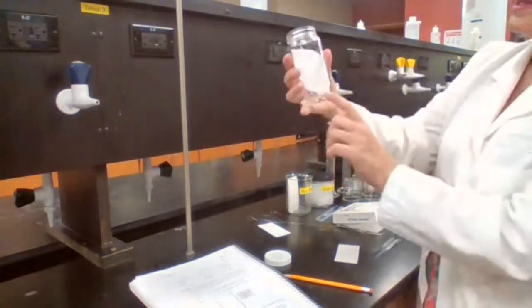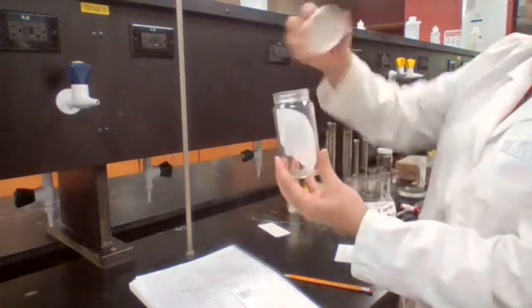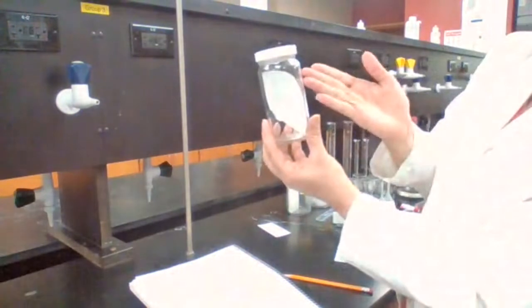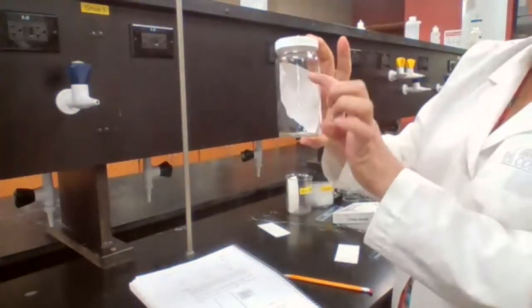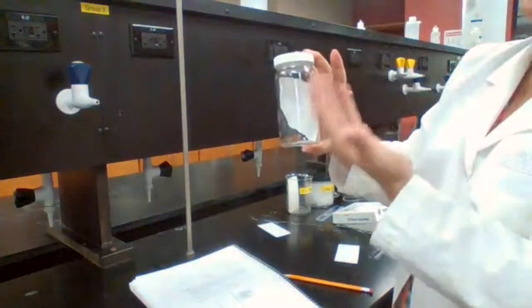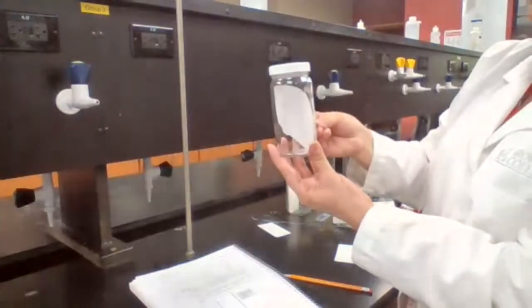But for me, the paper is going to pull up the solution and evaporate from the surface of the plate, and it's going to saturate the developing chamber with the vapor of the solvent faster.